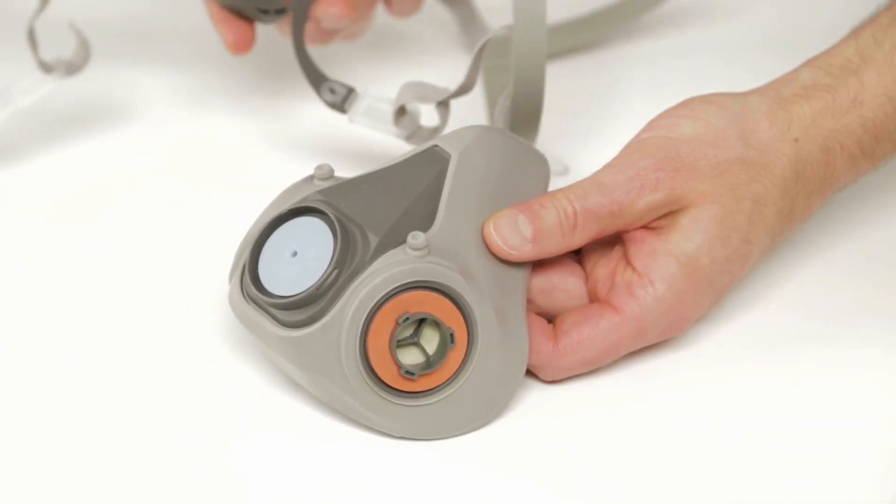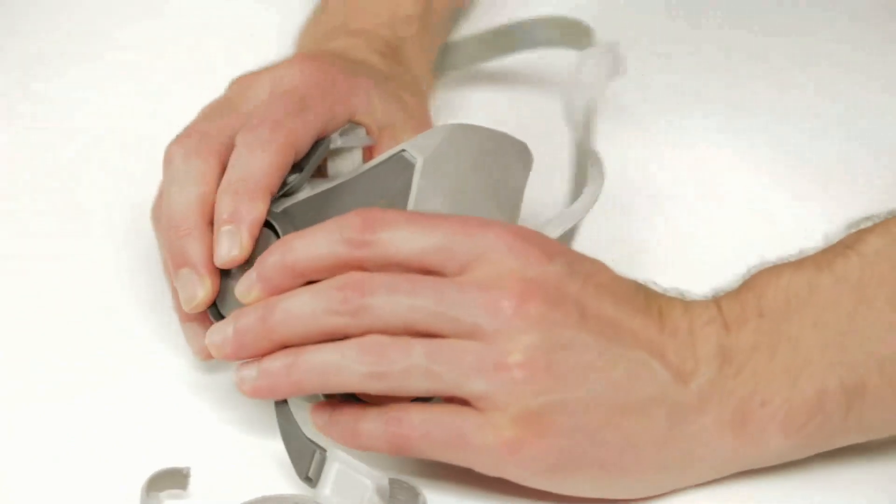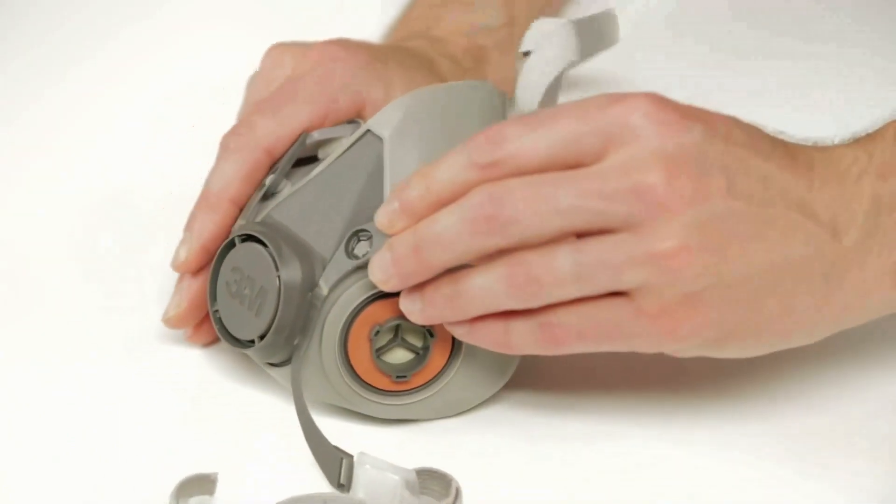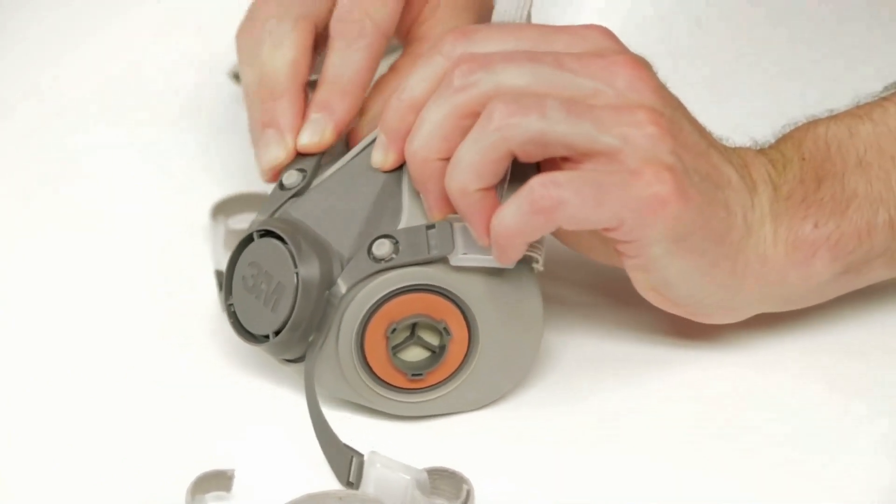To replace the respirator strap assembly, position the valve cover over the facepiece exhalation port and press firmly to snap it into place. Push the upper legs onto the facepiece buttons.